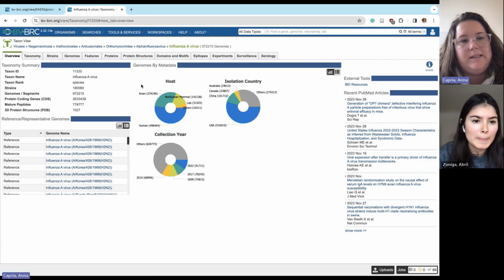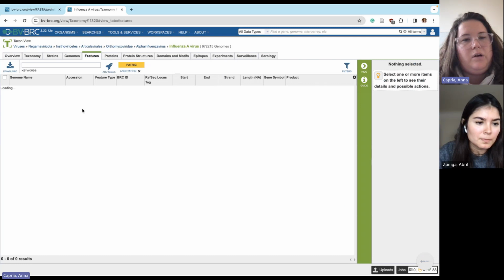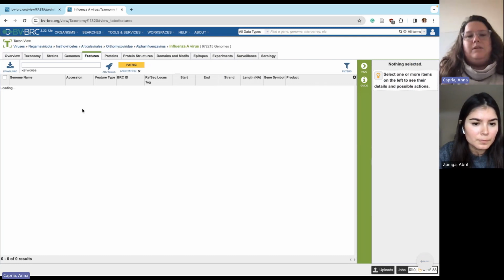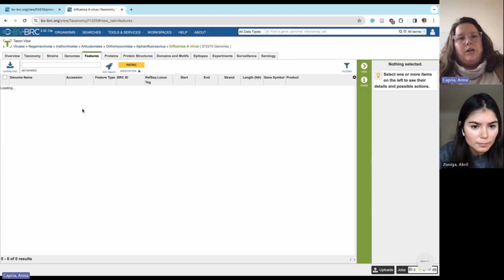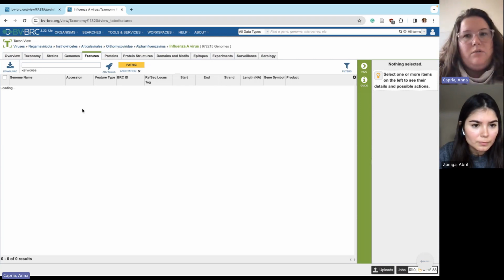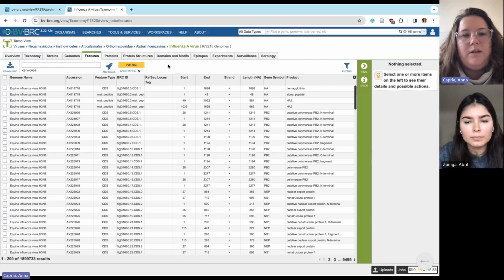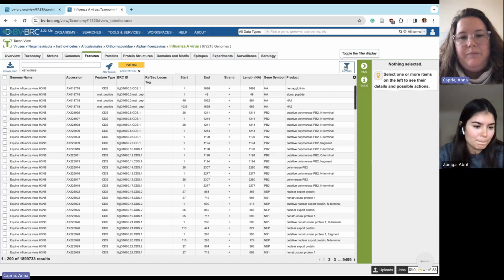Under organisms, I'm starting on Influenza A, which is one of our featured viruses, just to easily get you to be able to click on it. So I clicked on Influenza A. Then I'm going to go over to the Features tab. If you're not as comfortable searching through the BV-BRC tabs and things, I would recommend checking out the first webinar that we did. It took a second to load because we're loading over 1 million features. So sometimes it takes a second. Just be patient with the database as it's loading data.